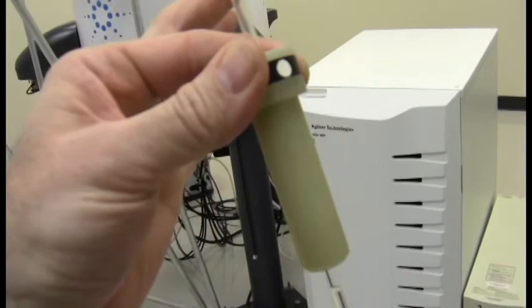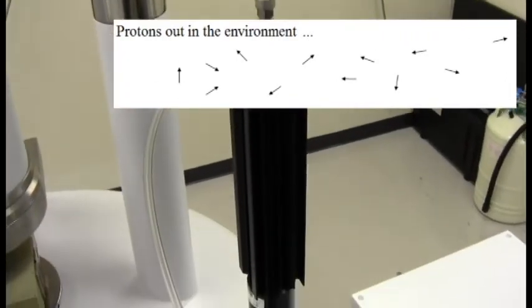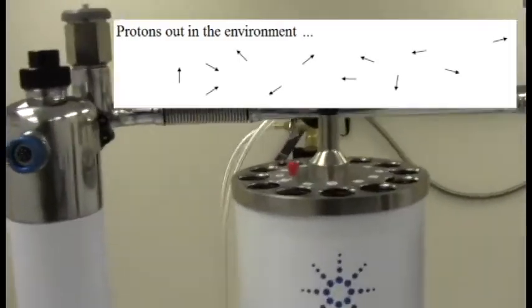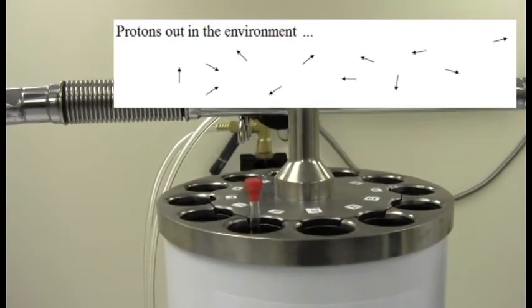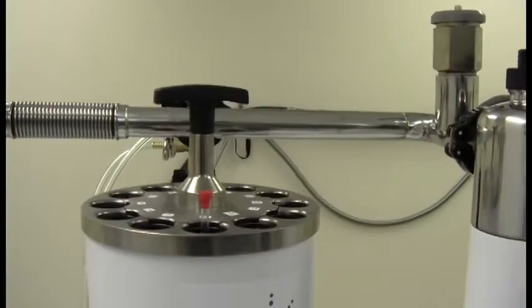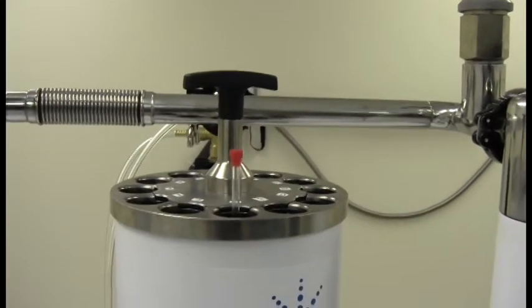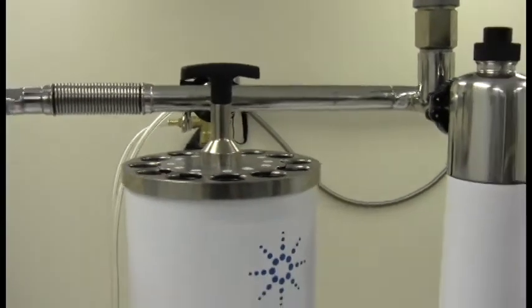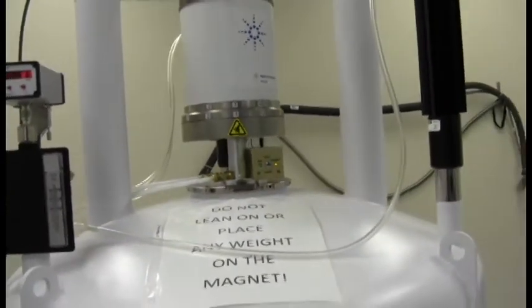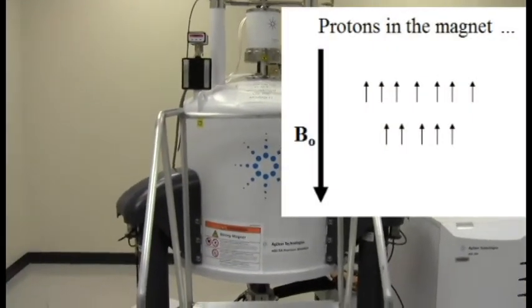Here's the sample tube now in its holder, and we're going to place it at the top of the magnet. There it is, sitting in the sample holder, ready for it to journey down into the magnetic field. Our sample is now floated on compressed air. The computer is going to turn the air slowly off. And our magnetic nuclei, which were out in the environment in the absence of a magnetic field, are now deep within a big honkin' magnetic field.